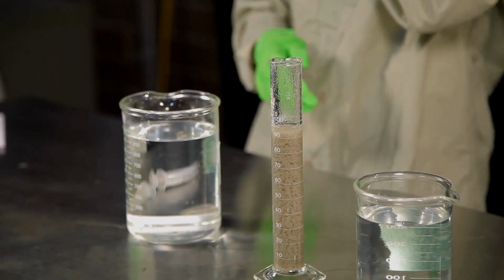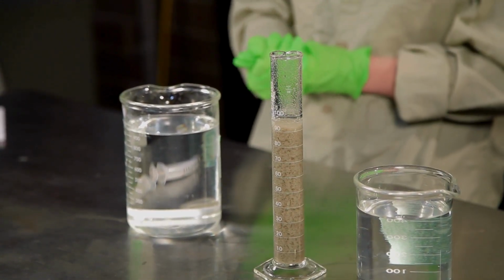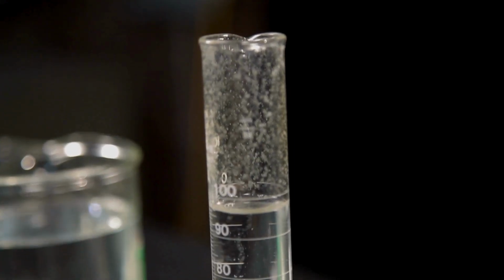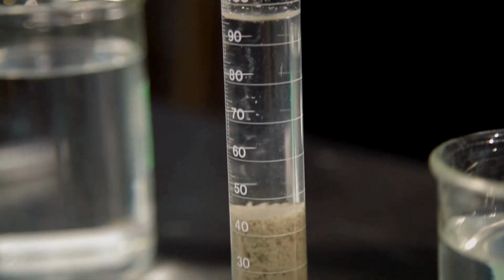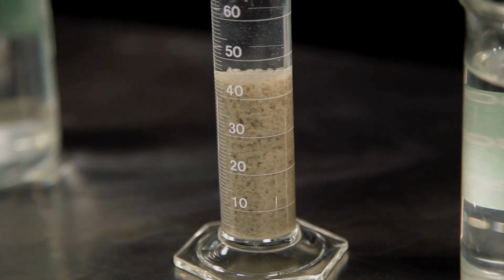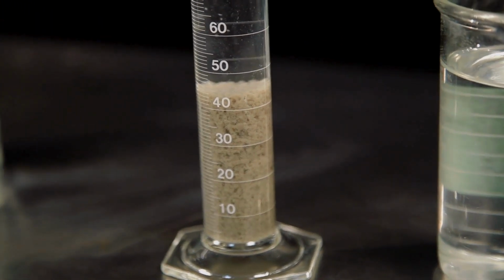The smaller agglomerates are now forming flocs which, through their increased mass, settle faster to the bottom of the cylinder. As you can see, the water that's being liberated is fairly clear of solids. The preparation of slurry using a coagulant before flocculation can save on flocculant costs and improve thickening performance. With colloidally stable slurries, often slurries containing clays, coagulation is required before thickening is possible.